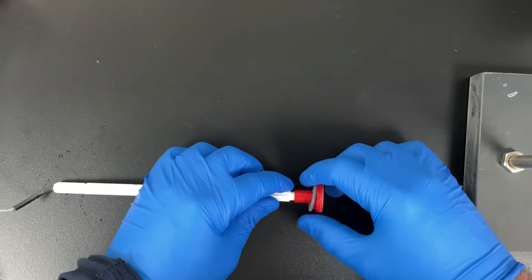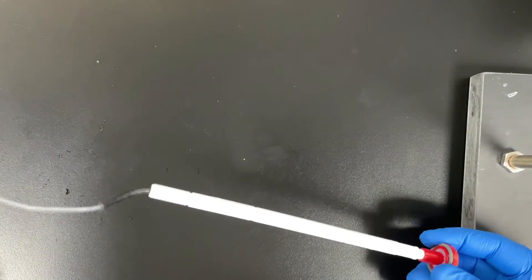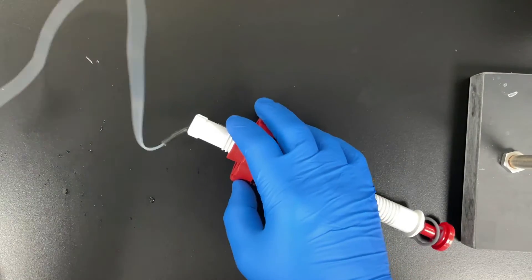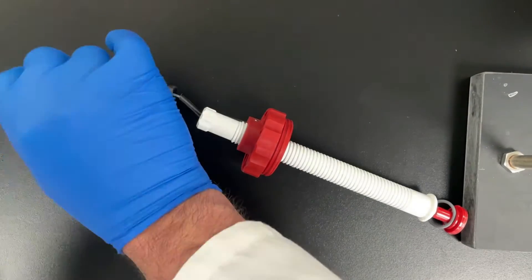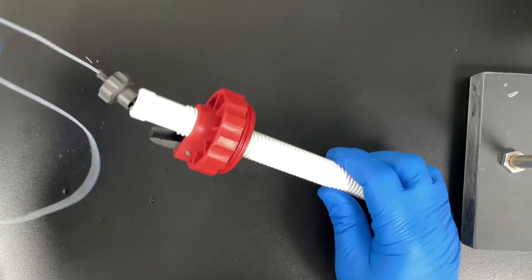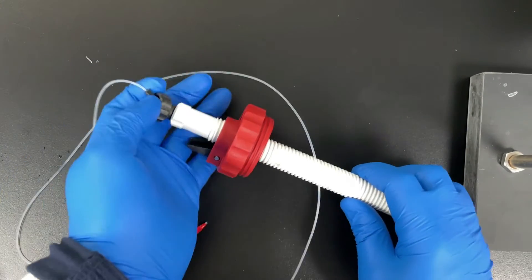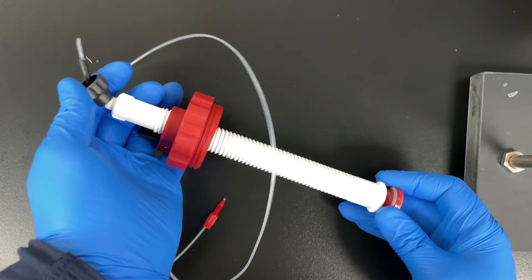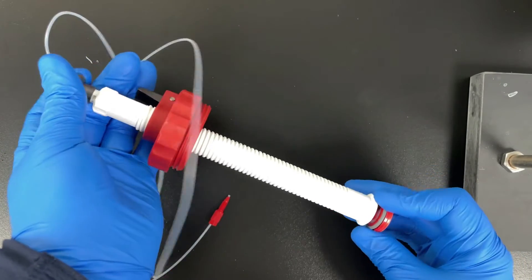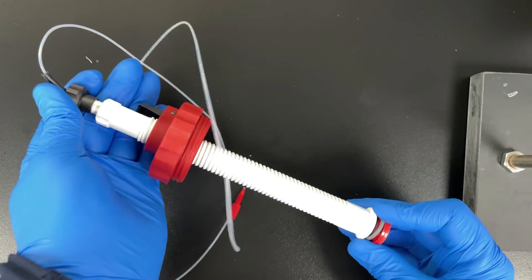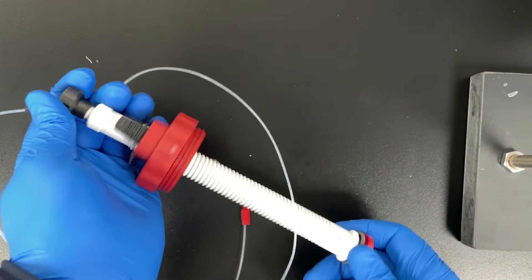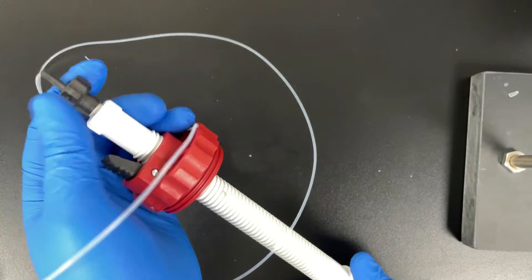When we put the filter screen back on, we want to make sure that it fits snugly onto the distributor. And then we're going to take the black nut and thread it back onto the central stem once we have the gasket fit over it there just right. This took me a second. There we go.